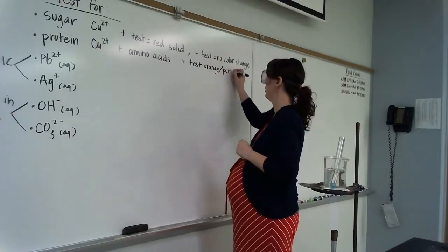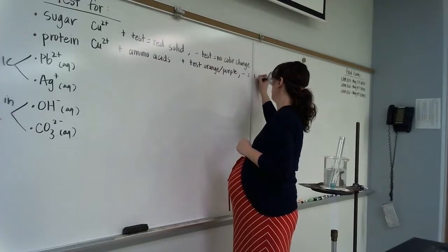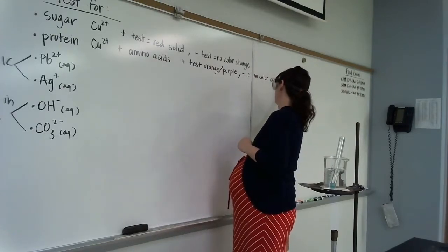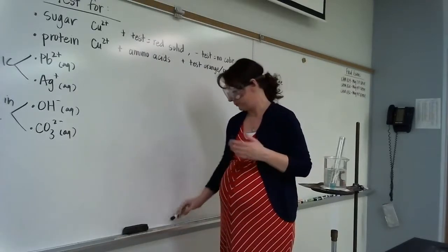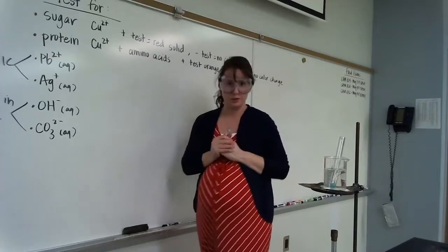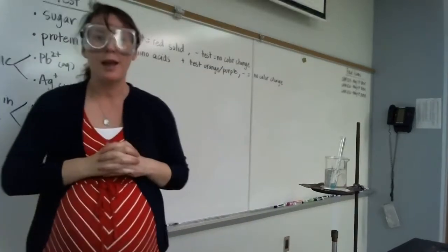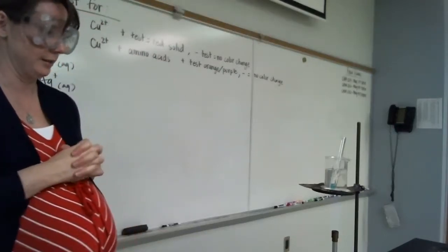/ purple, and negative, no color change. So what I would like you to do is pause the video now, decide, do you think there's going to be a positive test or a negative test based on the fact that this is from a lake, and then resume the recording when you're ready to see what happens.